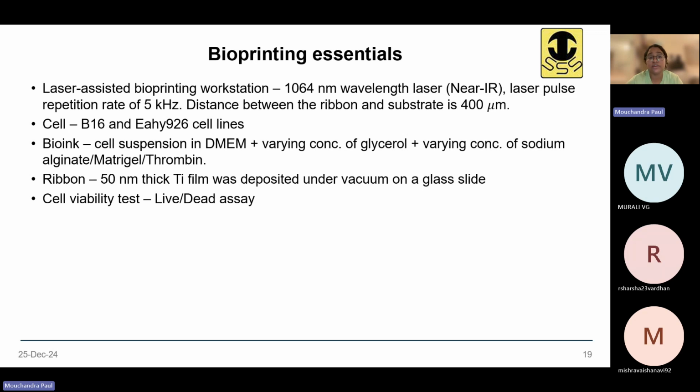And you know, viscosity is an important parameter when you want to decide whether you will get jet streams or no droplet at all. So viscosity is an important parameter here, and to modulate and control that, they're adding some biomaterial.